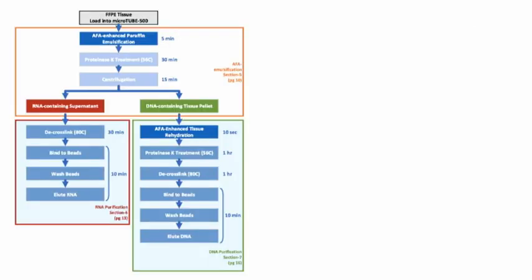And so in the interest of time, and just fast forwarding without going through a lot of data of head-to-head comparisons, we tested a wide variety of isolation protocols, all the usual vendors and all the usual protocols, and really settled on a protocol that has the Covaris AFA technology as the primary step, both here and then again here, for essentially a paraffin removal and emulsification, which is really a bit of a lysis of the cells as well, and then another disruption to essentially get the DNA out.